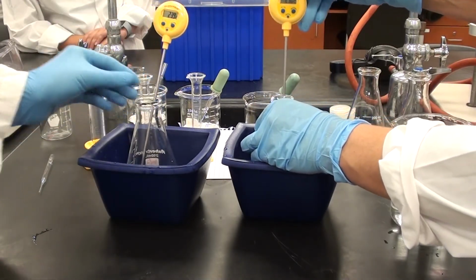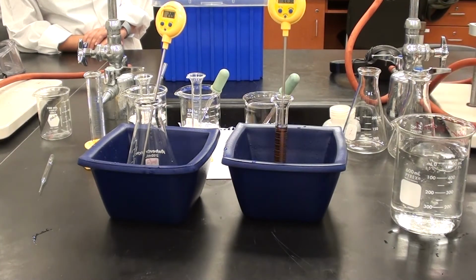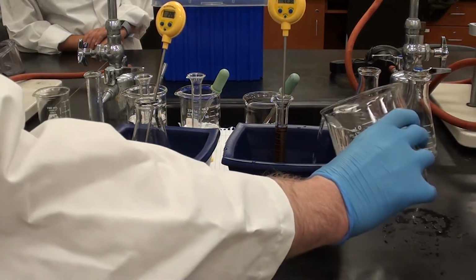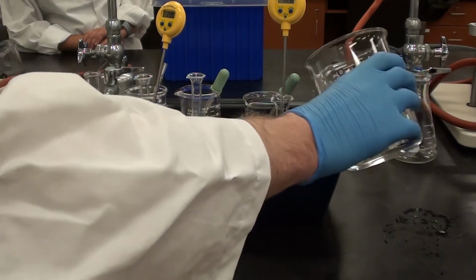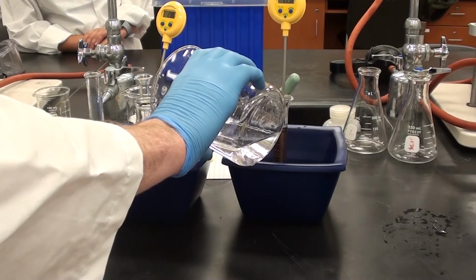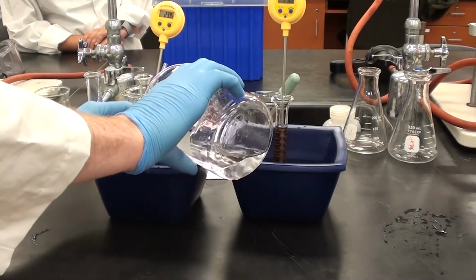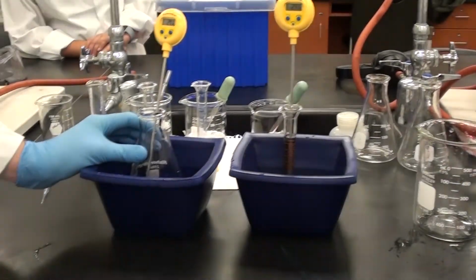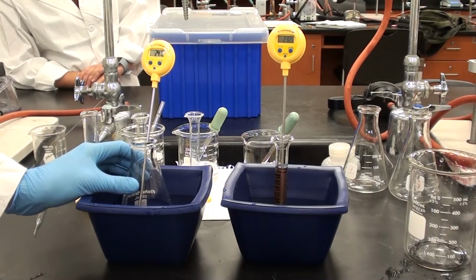Now to each of them we are going to add water to the buckets. About halfway. Now Jeff, what you're going to find is when you add it to that one, it's going to become buoyant. So you're going to have to hold on to that flask once you add sufficient water to it. There we go. I'm going to fix the shot here a little bit so we can get that into the camera. Okay, good.